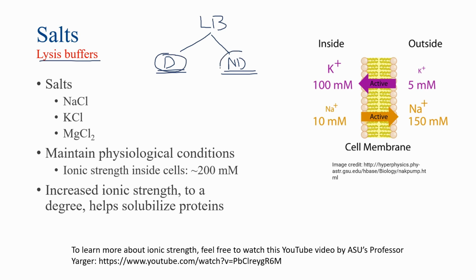Now, in addition to having detergents or having hypotonic solutions, it's also important to have other components that will make the lysate environment suitable for the necessary subsequent experimentation. For example, one of the fundamental things that must be added to a lysis buffer are salts. Common salts that can be used include sodium chloride, potassium chloride, and magnesium chloride. You'll often see sodium chloride or potassium chloride used within lysis buffer solutions. And there are different reasons for why that is. Fundamentally, the overarching reason is to create some ionic strength.